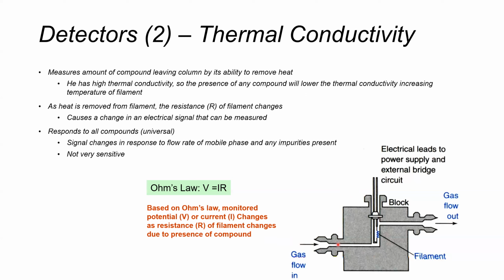This is what the detector looks like. There's a gas flow in, then there's an electrical circuit with a filament. This is the filament which will basically respond to the components in the mixture, and then the gas flows out.